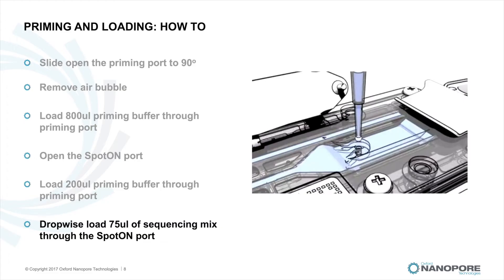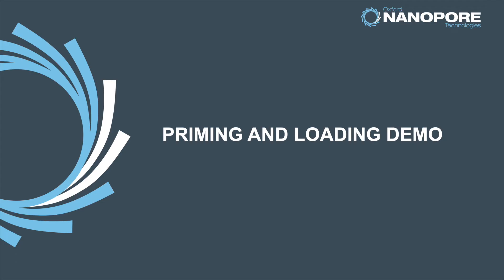Close the priming port and replace the MinION lid. You are now ready to start a sequencing run. I'm now going to pass you to my colleague Divya Merrington, who will take you through a demonstration of what I've just discussed.